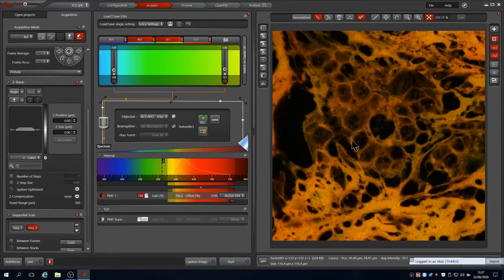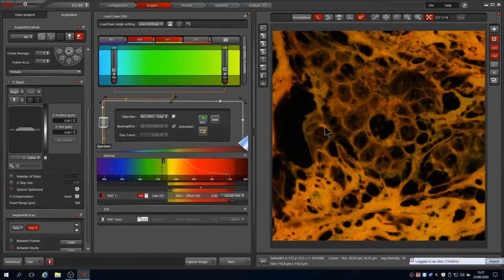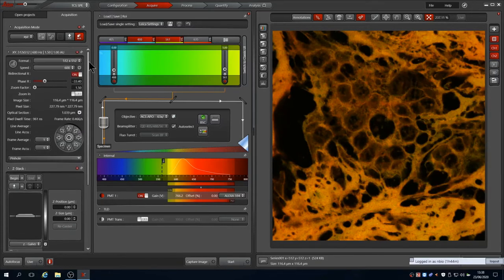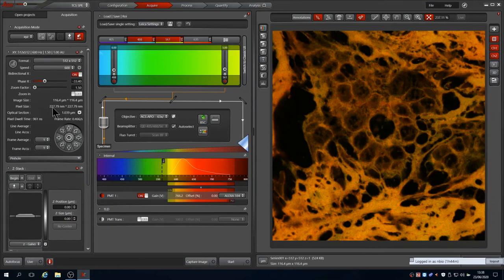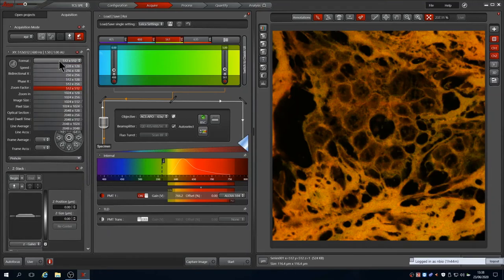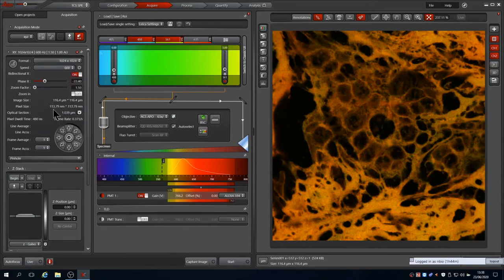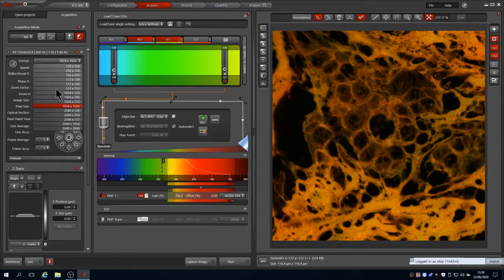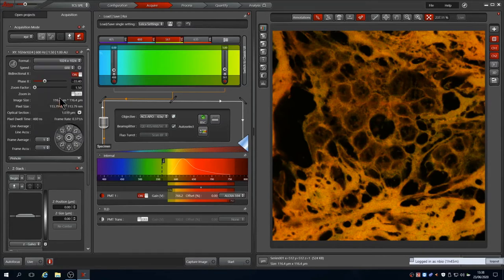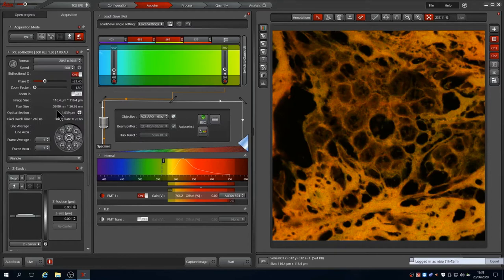If we go back to the XY tab, now that we have the channel parameters set, we can adjust the global parameters to optimise this. Swapping to 1024x1024 pixels will quarter the pixel area, but they are still quite large for the numerical aperture of this objective and the wavelength being visualised. Swapping to 2048x2048 pixels, quarters their size again. These are well within Nyquist sampling.